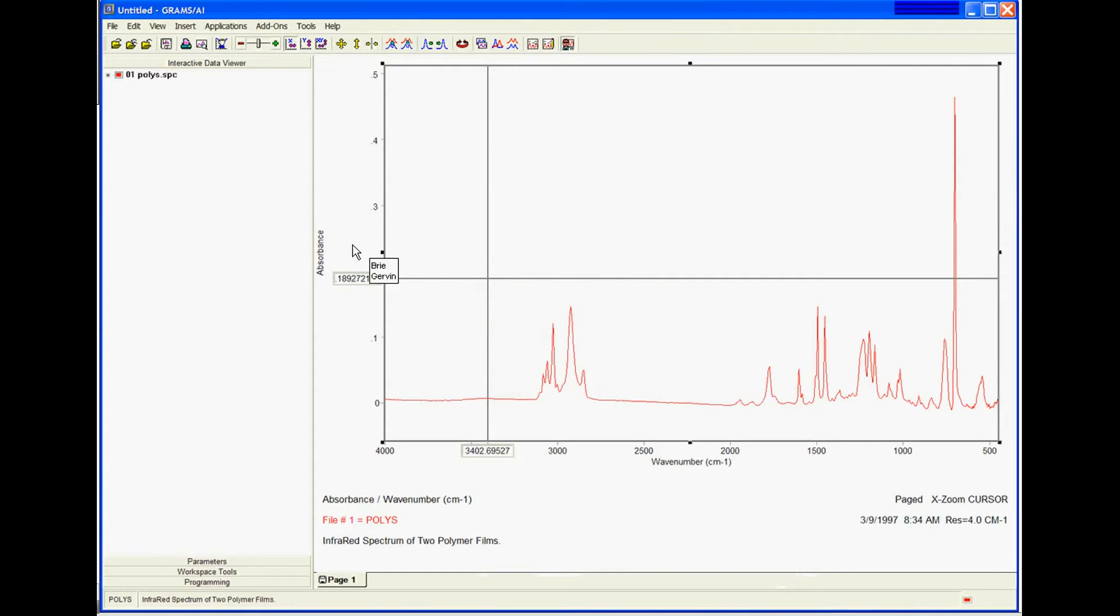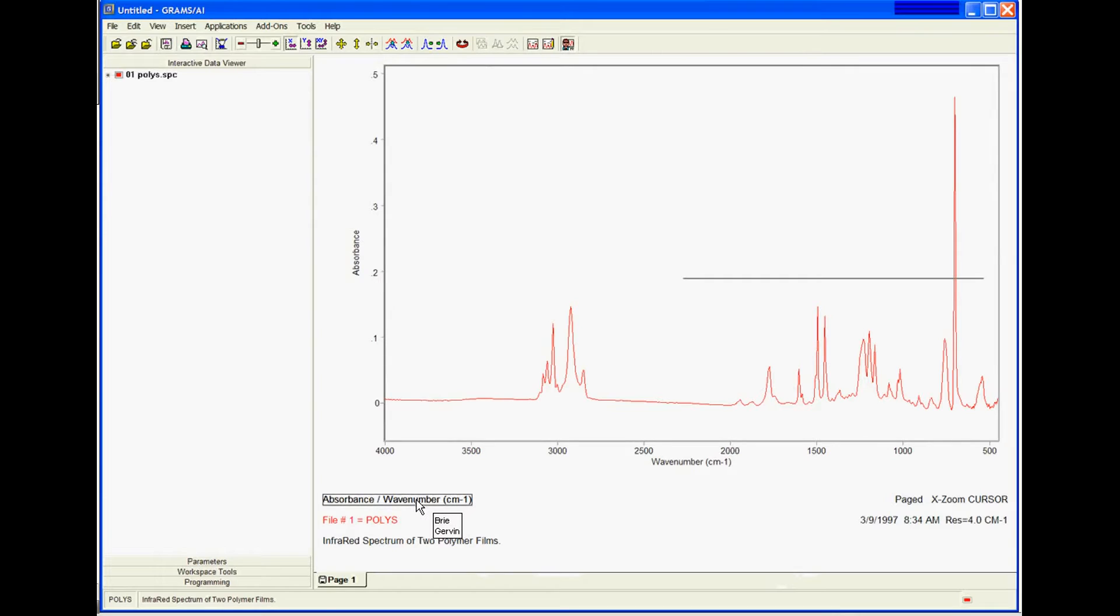So now you can see we have our labels right on the plot. That means I can delete this. I can just highlight it, hit Delete, and it goes away.